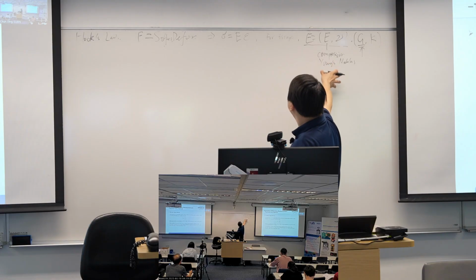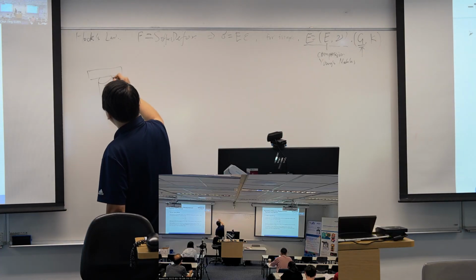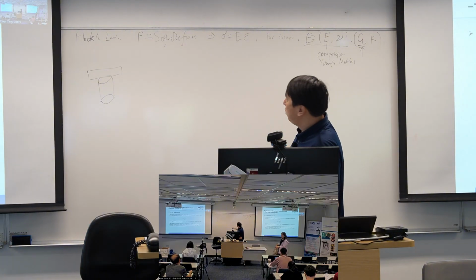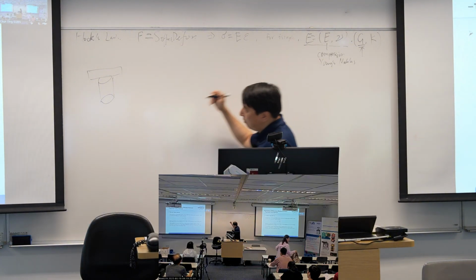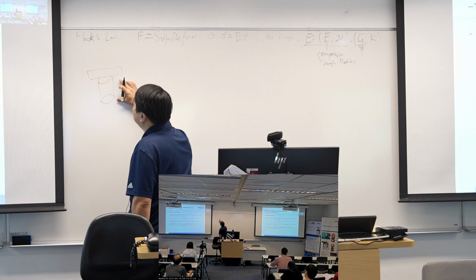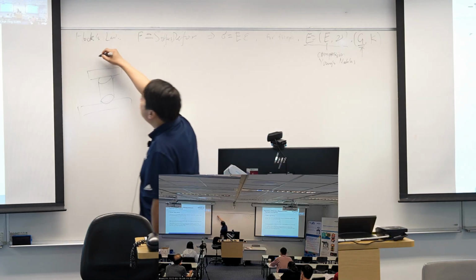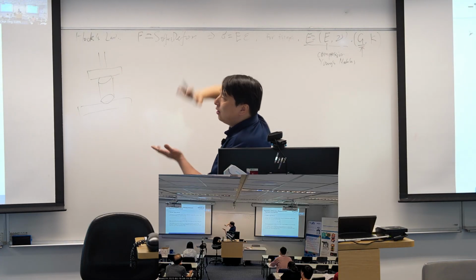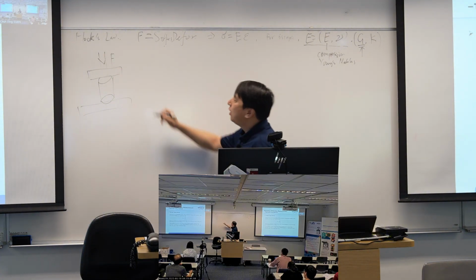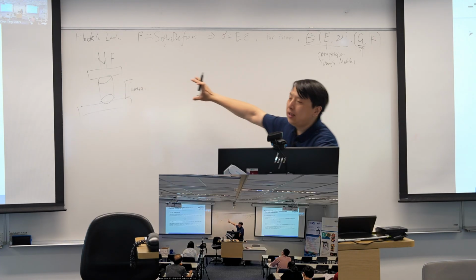And to measure the Young's modulus, usually we would use a machine. We would make a device with a defined shape using our materials, fabricate this device or sample, and then we put it on a plate and use a stylus to press it. With this stylus, we can record the force, and of course we can use a camera here to monitor its height change.